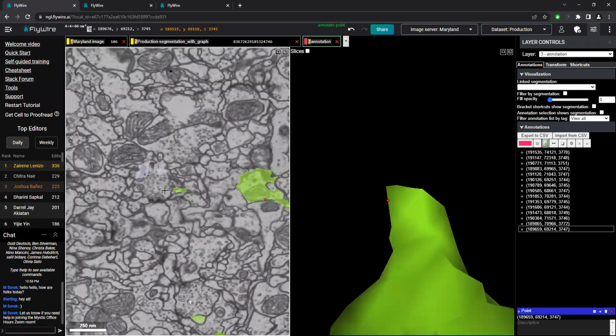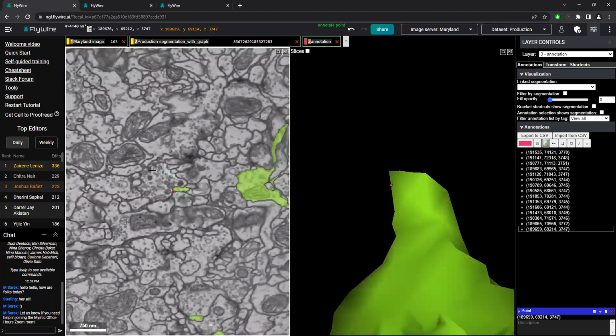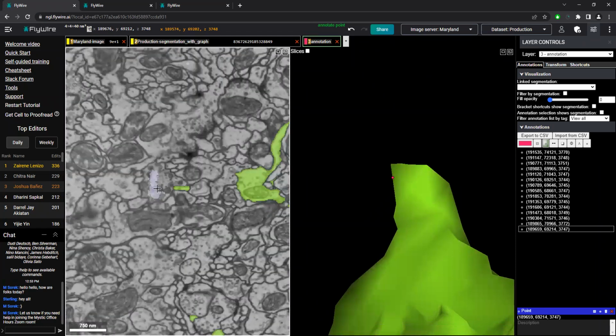The main thing I'm going to look at is this larger structure here with a bunch of these vesicles and some larger intercellular structures inside of it. That's a good way to know that my little horizontal oval is going to be nestled in, near this structure in another slide when I go to that jump.